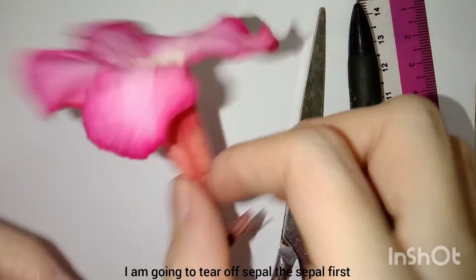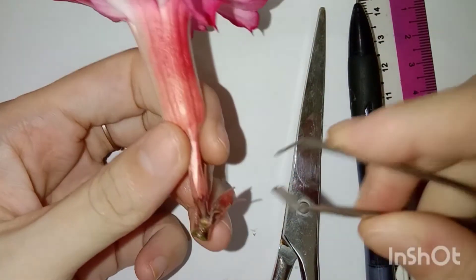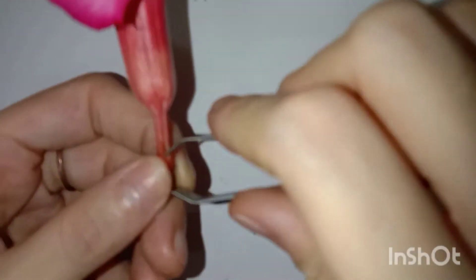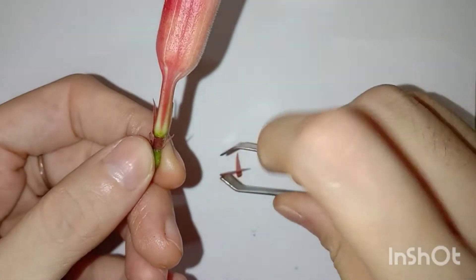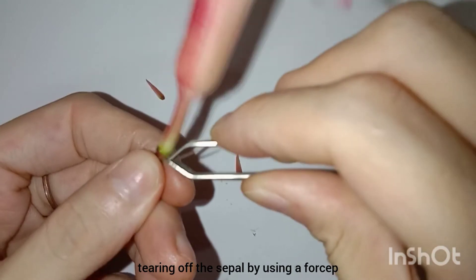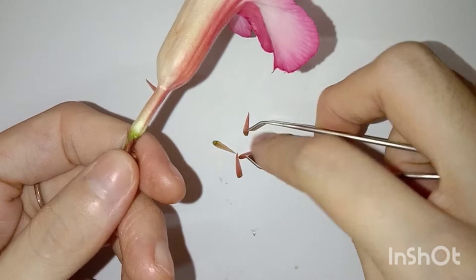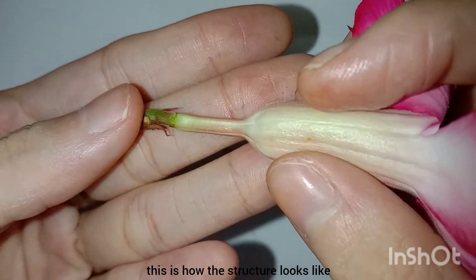And now I will tear off the sepal first, tearing off the sepal by using a forcep. And this is how the structure looks like.